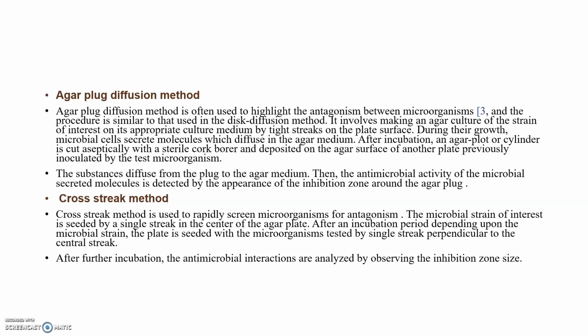Okay, so this is the agar plug diffusion method.